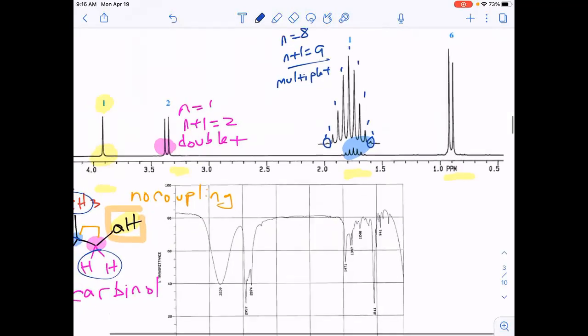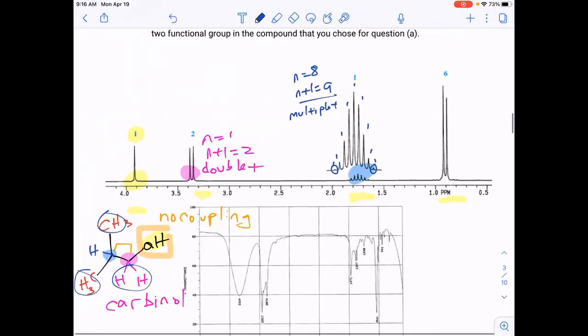All right. Now, you see down here at 1, again, all of these chemical shifts are on purpose, right? Things show up where they show up because of their chemical environment. So those methyl groups are showing up in the range where alkyl groups will show up, if there are not a lot of functional groups present. So somewhere between 0.1 to 1, anywhere in there, right? When you put more electronegative functional groups on, then they start shifting a little bit further down.